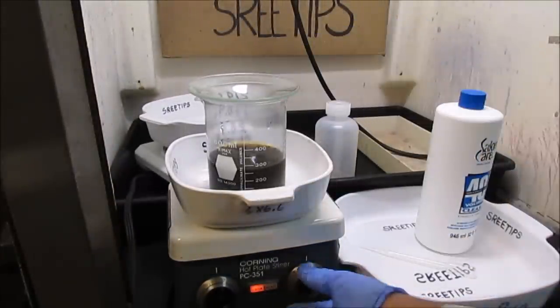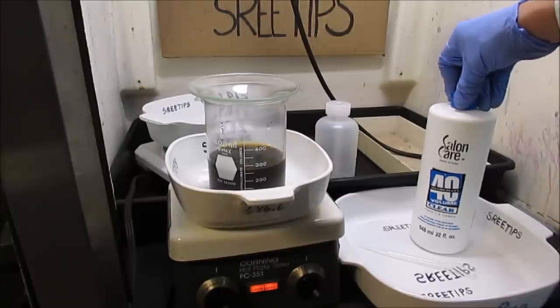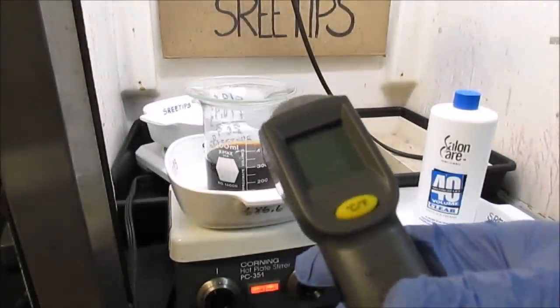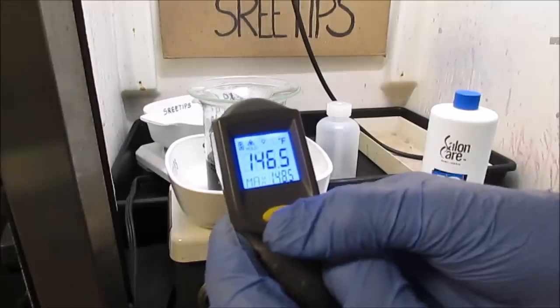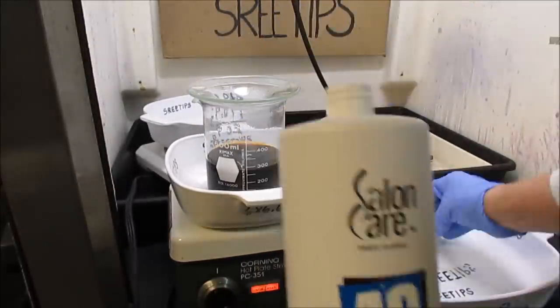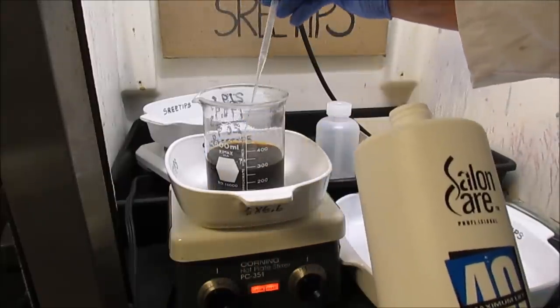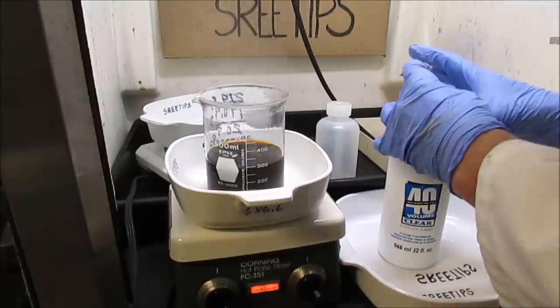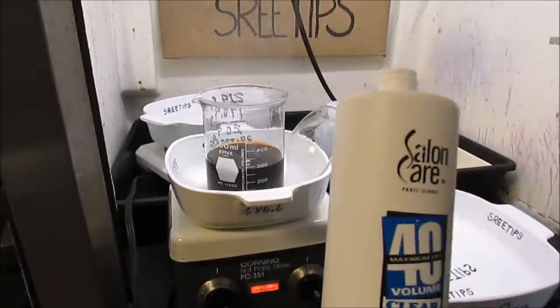I've got the solution on stirring now. I'm going to add some heat and get this heated up, and then add some 12% hydrogen peroxide until I get all the mixed PGM metals dissolved. The solution has been stirring and on the heat now for about 20 minutes. We've got the solution up to 146°F / 63.6°C. Now I'm going to start adding small doses of hydrogen peroxide with a pipette — about 3 ml at a time — and I'll just keep adding small doses until I get all the powder to go into solution.